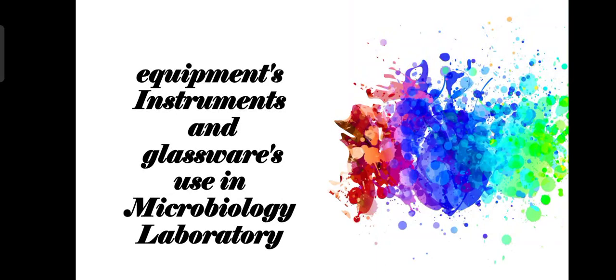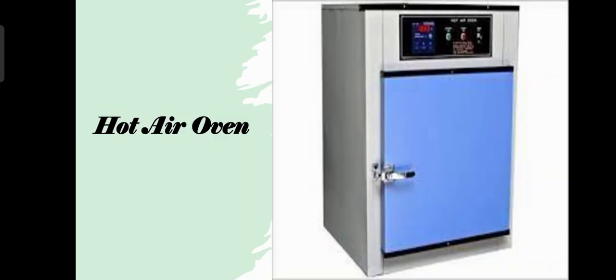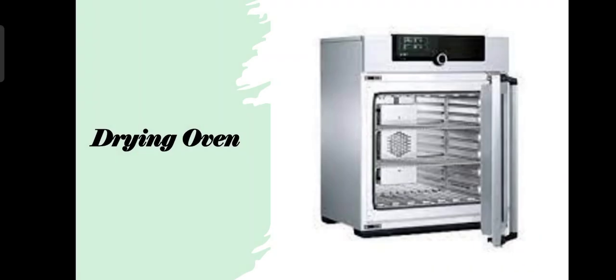Today I discuss equipment, instruments, glassware and non-glassware used in a microbiology laboratory. Hot air oven. A hot air oven is used for sterilization. It sterilizes glassware and non-glassware. Drying oven. A drying oven is used to dry samples as quickly as possible by removing moisture from the chamber.